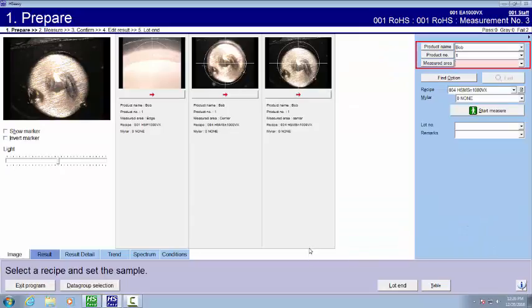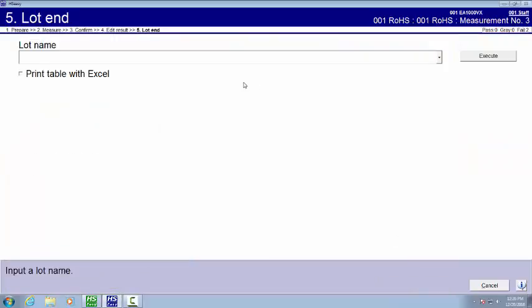And you'll see we're back to where we started. Now let's do a lot end. And we'll go example for our lot end. Hit execute.